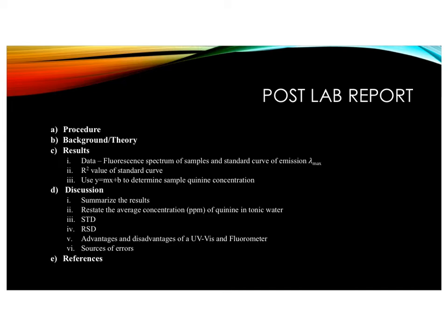This slide talks about your post-lab report. Please make sure in your report that you have a fluorescence spectrum, so just graph your wavelength versus intensity, and provide your R-squared value, provide your y equals mx plus b formula, and use your y equals mx plus b to develop a concentration curve from your standards.